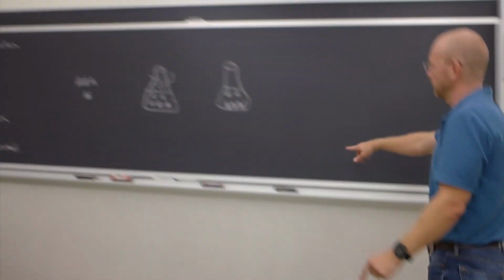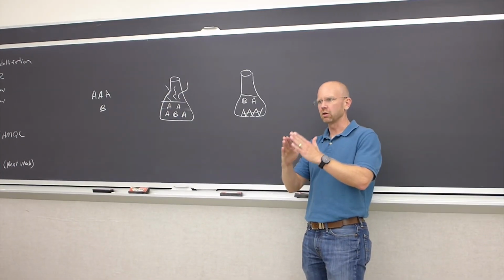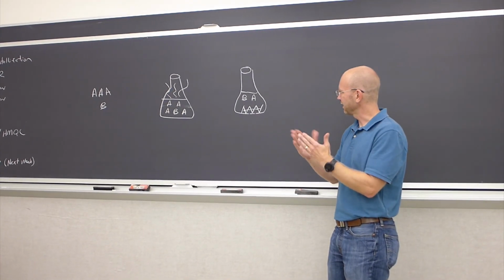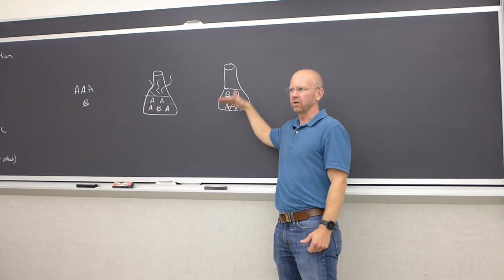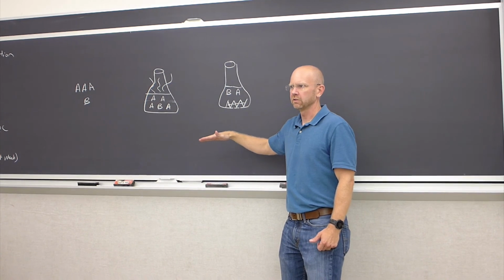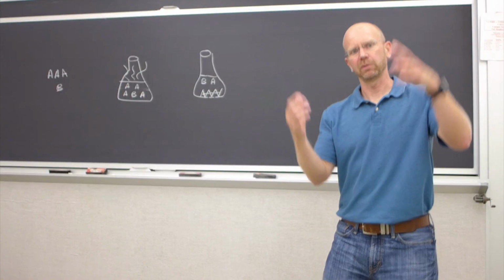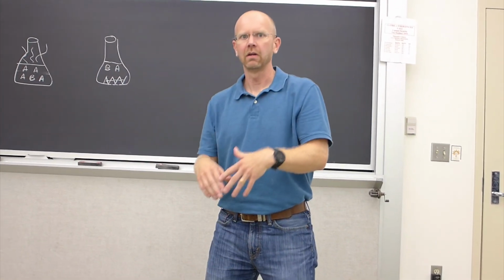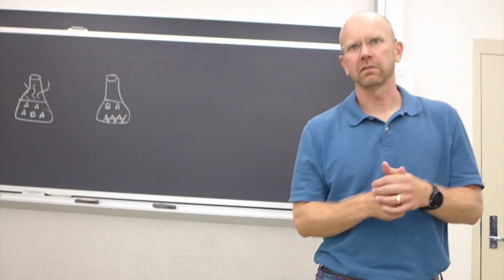The reason why is what we're hoping to happen is have these perfect crystals of something form. And we want to give the solution plenty of time to slowly layer that crystal, layer upon layer, a pure compound. If you crash it out too fast, say you stuck it in ice, for example, everything would crash out all at once, A and B and everything, right? So we don't want to rapidly cool it because then we're not going to affect the purification. We're actually just going to precipitate. That's the difference between recrystallizing and precipitation. You just precipitate everything out and then it's not pure, right? So slow cooling tends to be the best, all right?